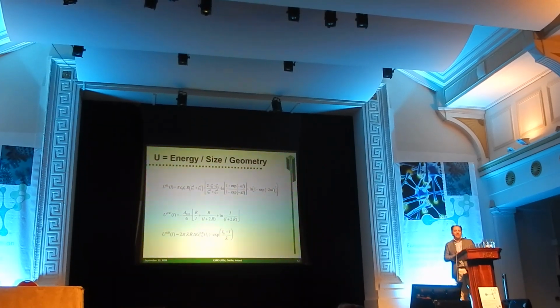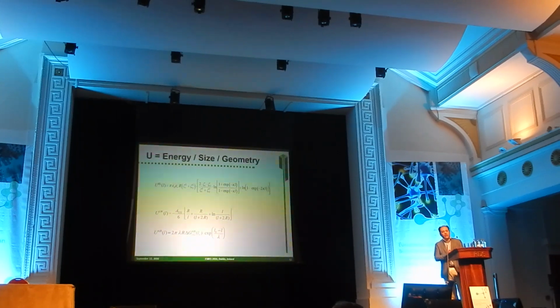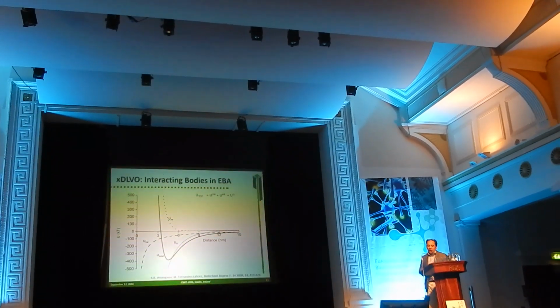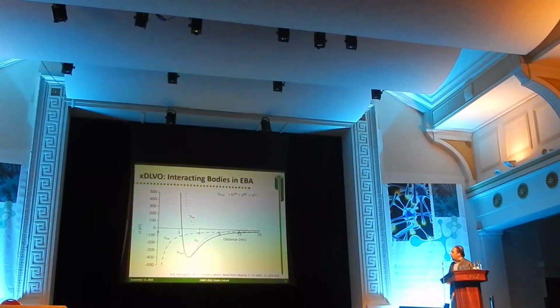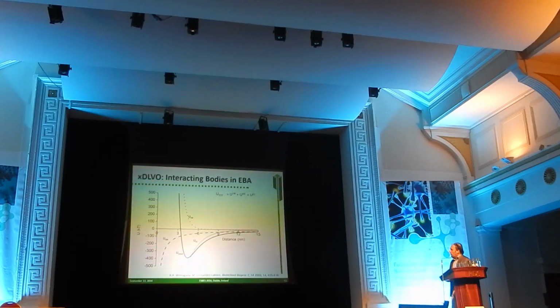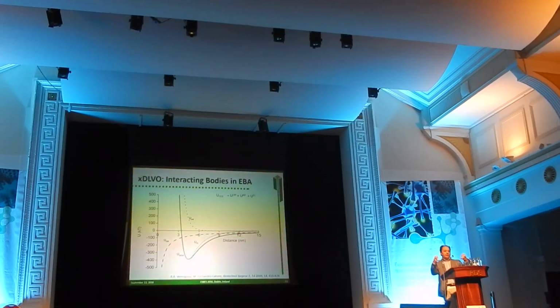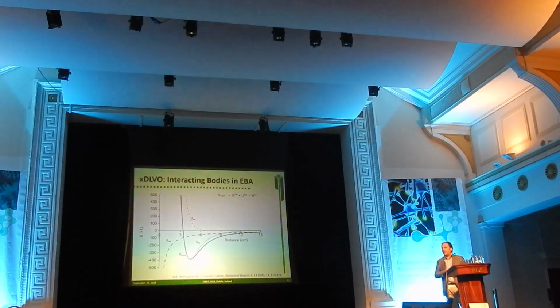So, with two relatively simple experimental methods, contact angle determination and zeta potential determination, or streaming potential determination, you fit these equations and you get something like this, where all the components, or the energy, in units of kT in this case, as a function of distance, is going to give us an idea, or a more quantitative picture, of the energy that two particles would feel when they approach or when they diverge, right?